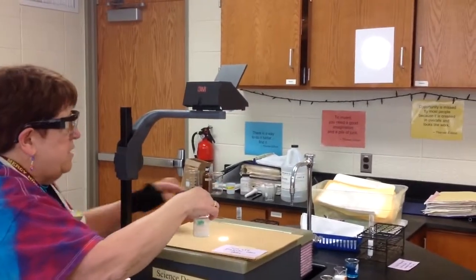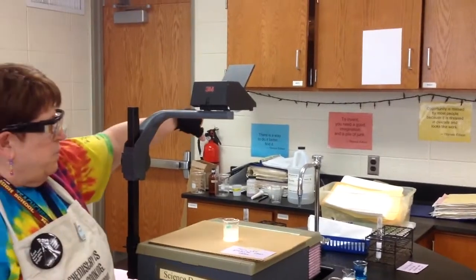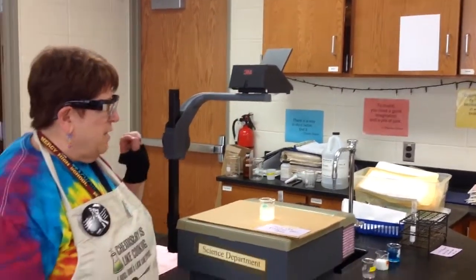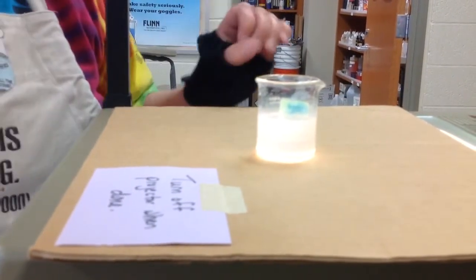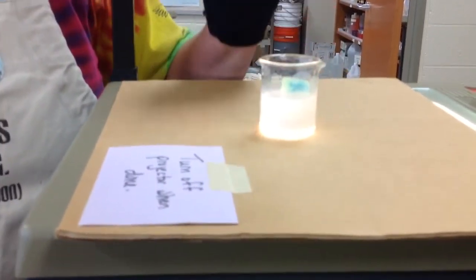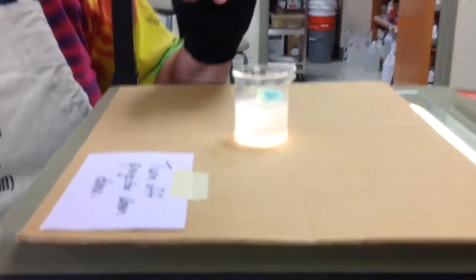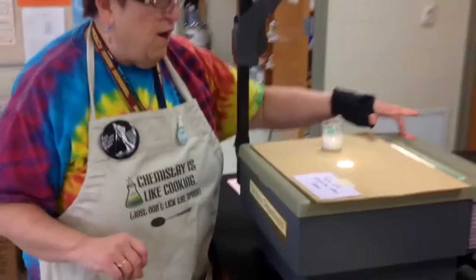But if we put this on the light here from the projector and look up at the white paper on the wall, there's no light going through. The particles are blocking the light. But if you look at the bottom of the beaker, it looks like it's glowing because the light is being scattered by the particles, and that is what is known as the Tyndall effect. So that's one of the things you'll be looking for at this station, the Tyndall effect. When you're done, please turn the projector off.